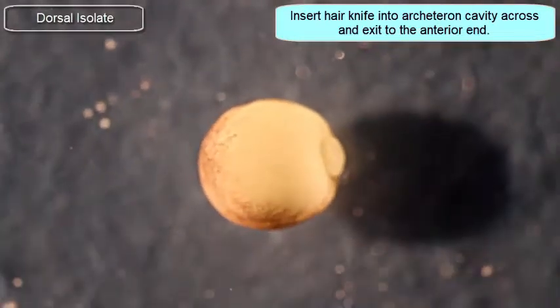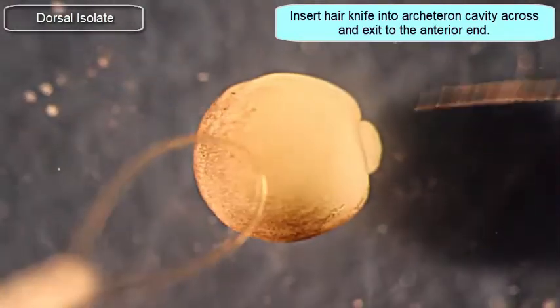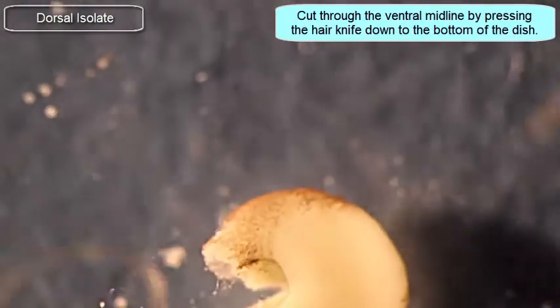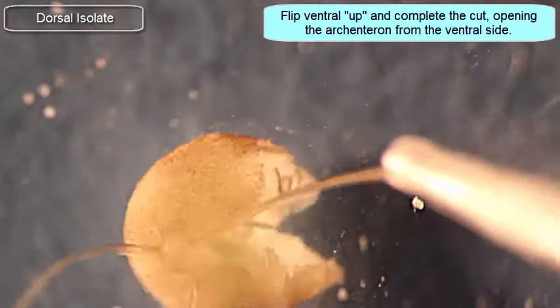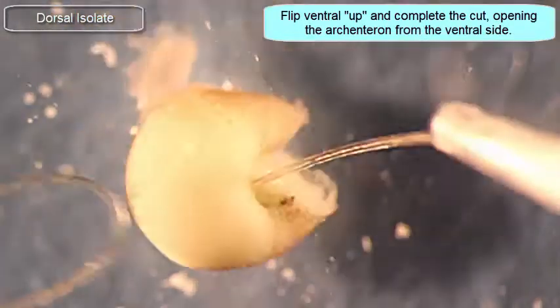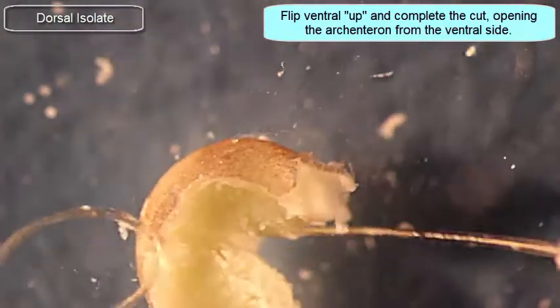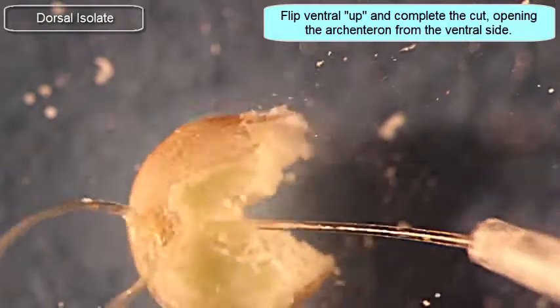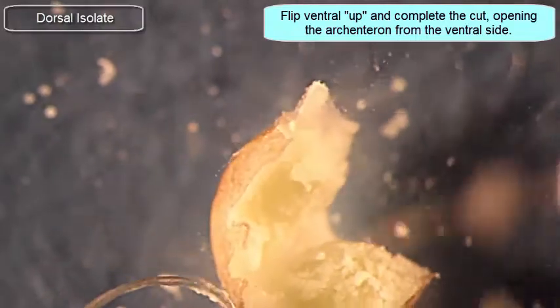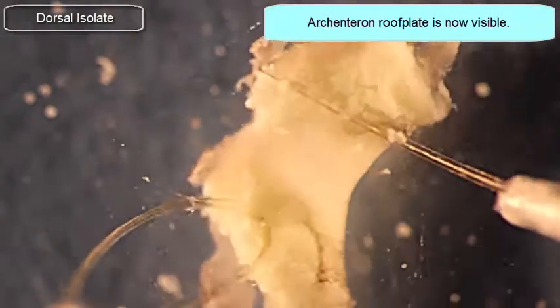I've oriented the embryo. I'm going to insert the hair knife into the archenteron on the right-hand side — the posterior end — and push it all the way through to the anterior end. I'll then tear up the ventral side of the embryo, making a large incision right down through the yolk plug. Now I can slowly tease out the floor of the archenteron with the hair knife, opening up that space.